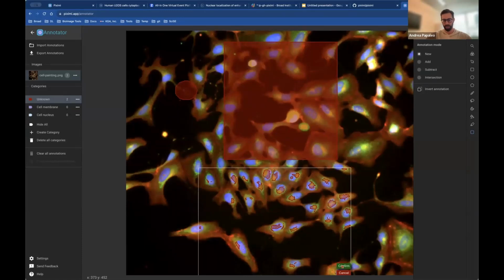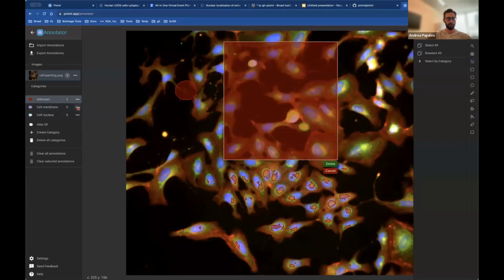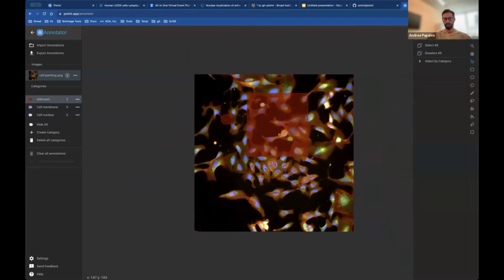I think you should be able to change the thresholding, but that is not here. That's fine. And then you can go through again, select on an image, and then you can, yeah, sorry. So, some pain points here, but you can recategorize them.